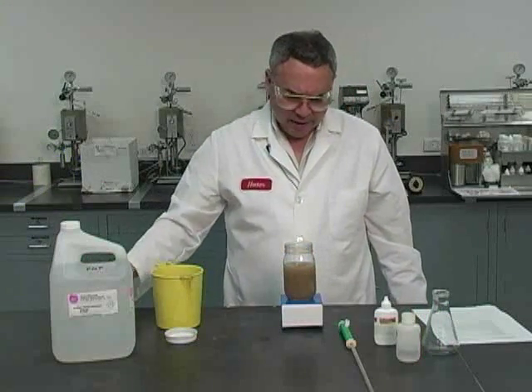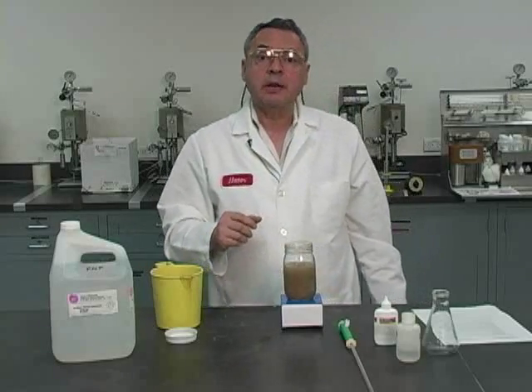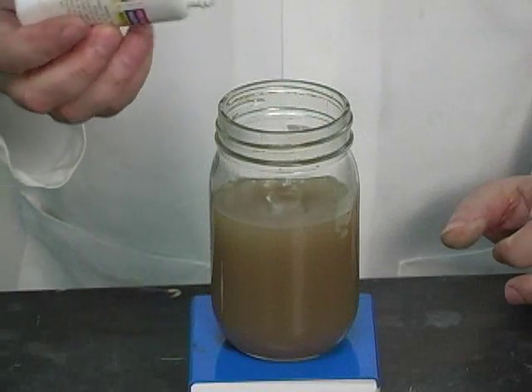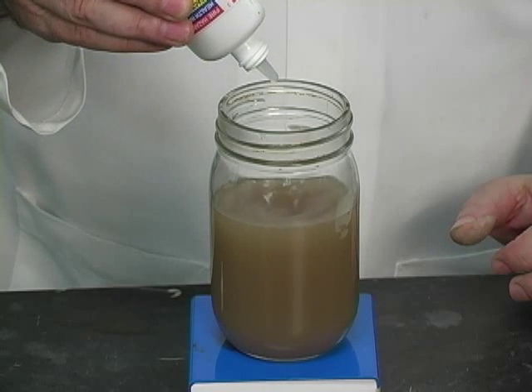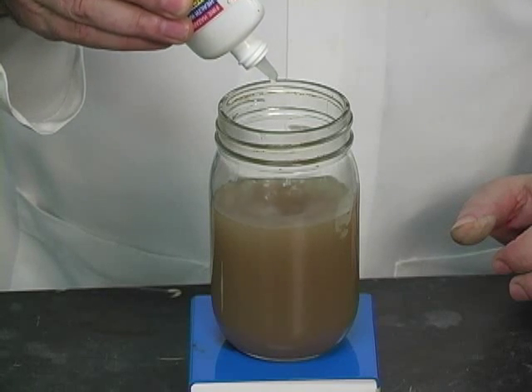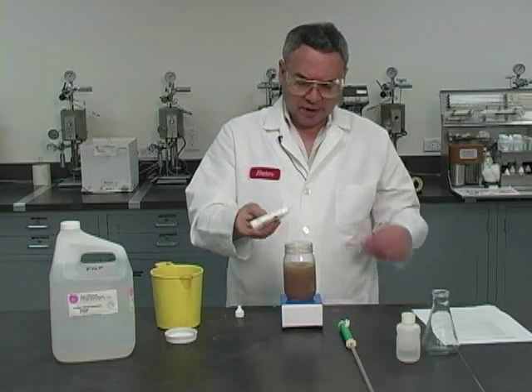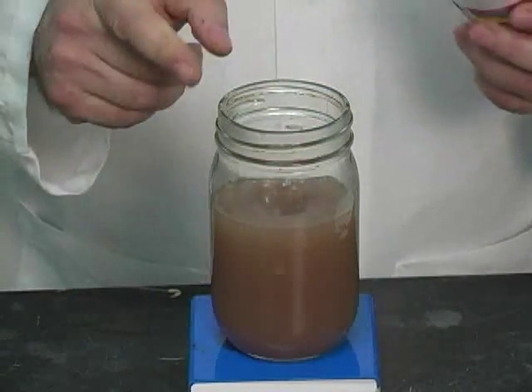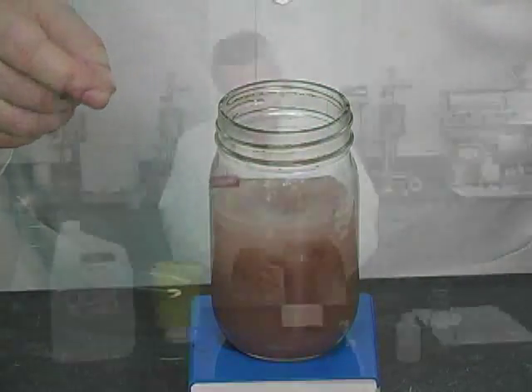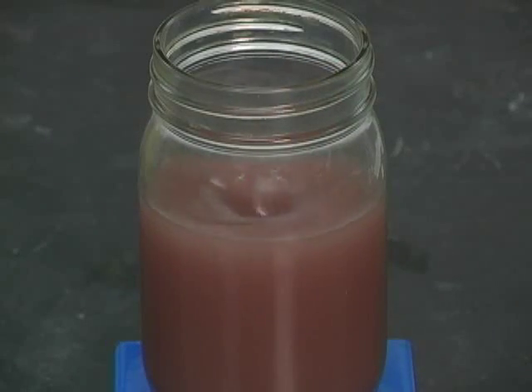Stirrer is working fine. So the next step is to put some phenolphthalein. We are going to add, as a matter of fact, 15 drops. And we will have to neutralize this. So that's the reason we are using this color indicator. That's 15. Now a pink color will show. It's already showing very clearly. This is turning reddish, but I don't have any problem in seeing that this is pink.